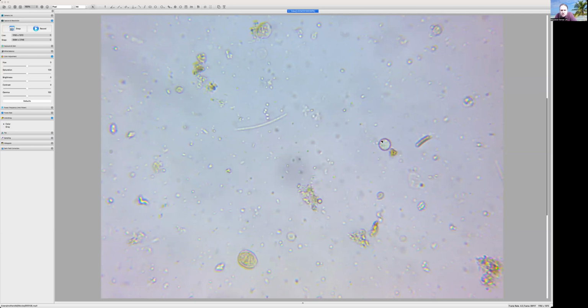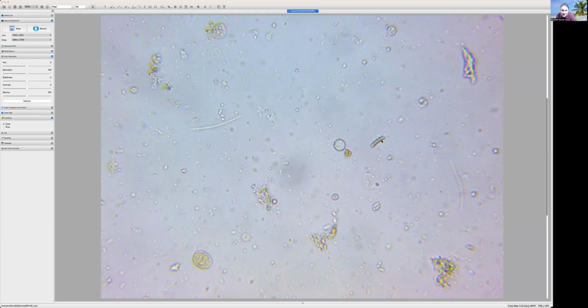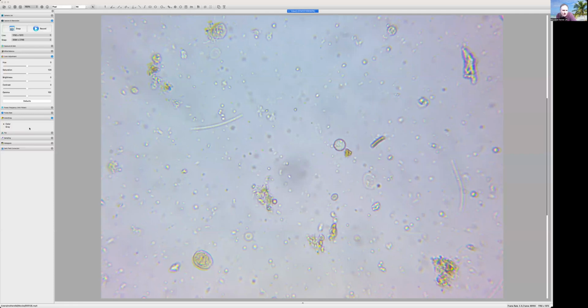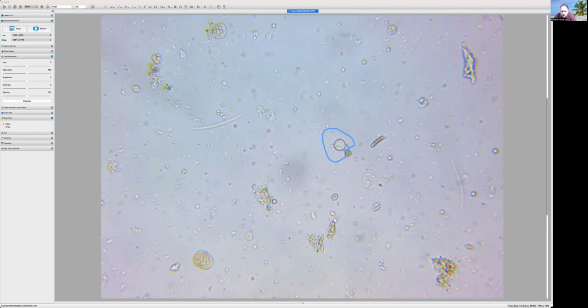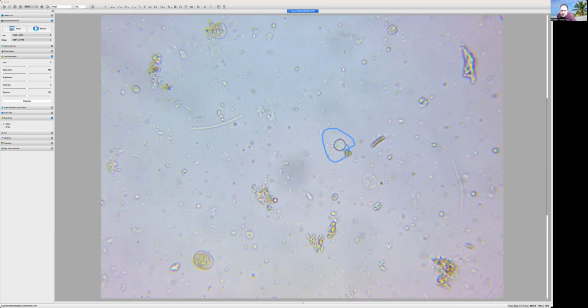Okay. So I don't want to spend, oh my gosh, this slide here. This is just loaded with activity. I will get my pencil out and I will do some jump out at me things. This is a cyst. I'm going to say with that thick outer wall, going to be an amoeba cyst probably.